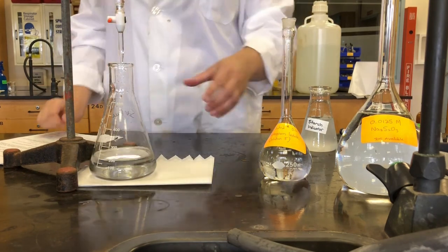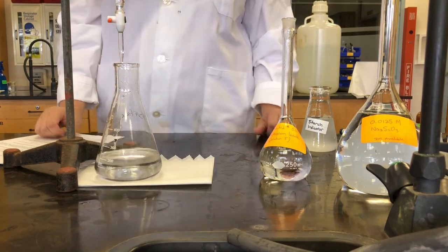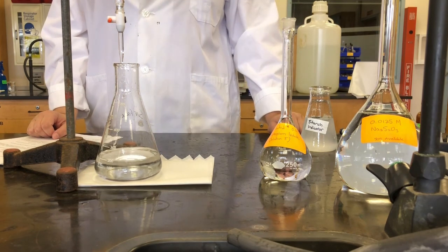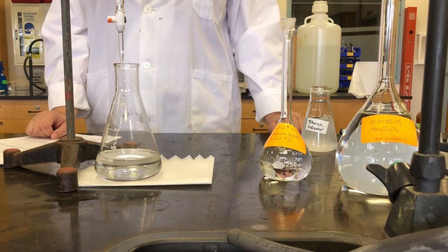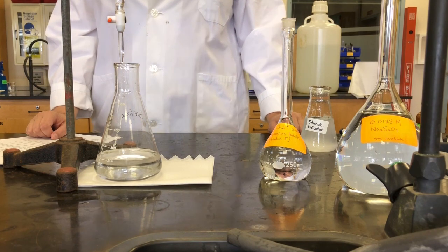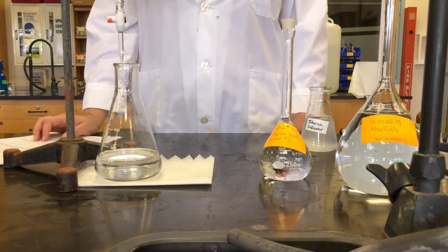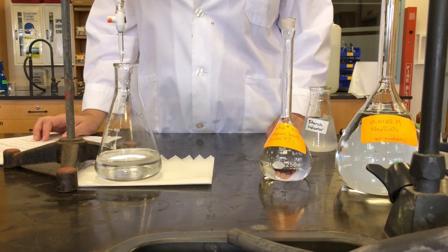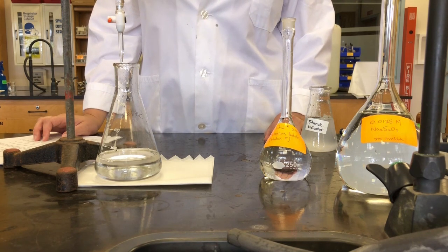There we go. So now we have a clear, colorless solution. So that's the end point of our reaction. Okay, so that's the titration we're going to use to standardize our sodium thiosulfate, and that will allow us to calculate the concentration of that sodium thiosulfate, and then we're going to use that to titrate our samples.